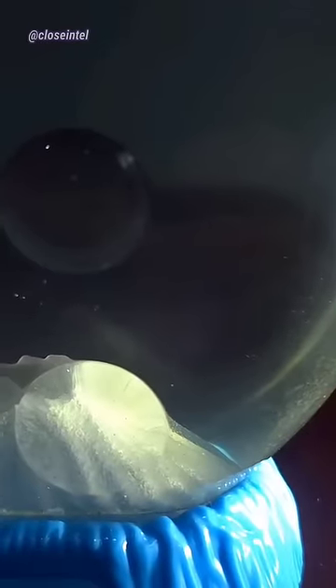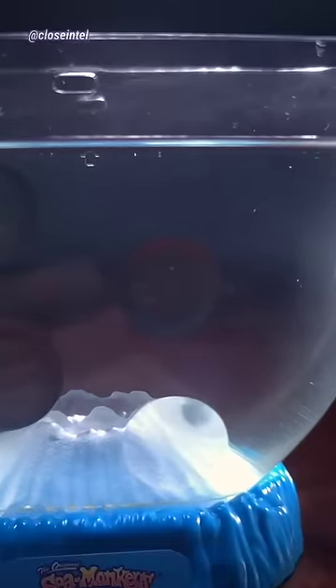The first day there was nothing, but the second day there was one little tiny sea monkey swimming around. And the third day there was tons of them.